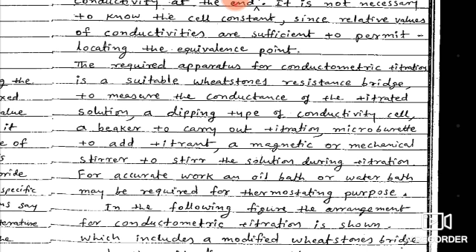These are the assemblies of the equipment, that is, the conductometer.